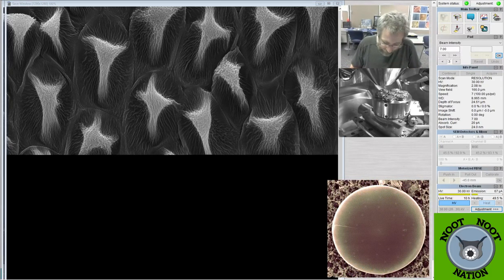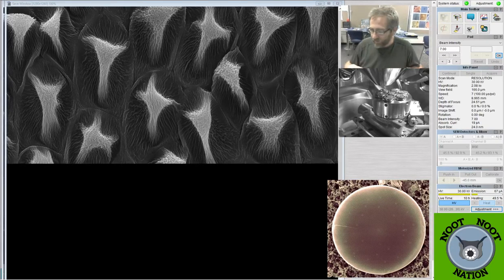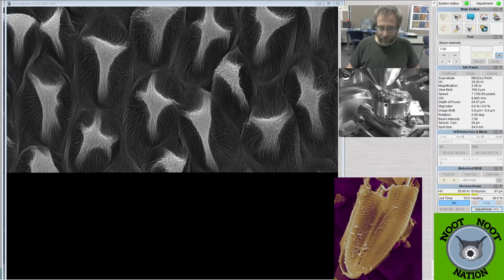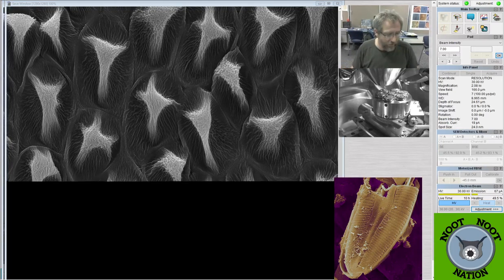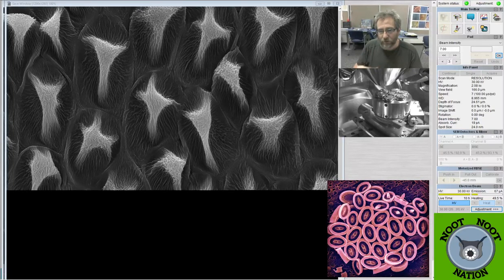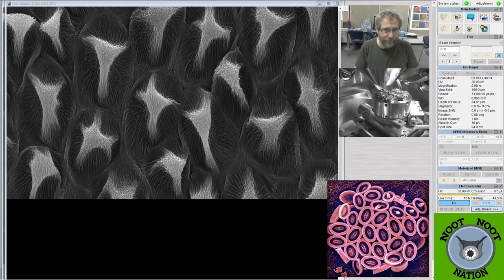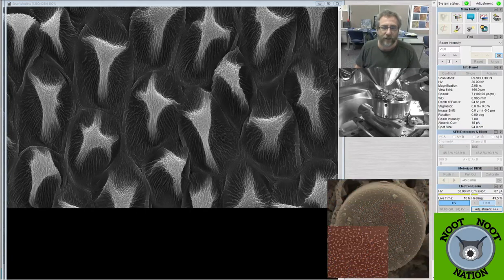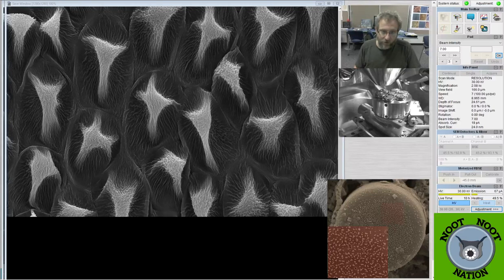So I collected that. I brought it back to my lab here. And then I disassembled the flower a little bit by pulling it apart with a pair of tweezers, and then put it onto an SEM stub, which was coated with carbon tape on one side. On the other side, it sticks to the actual SEM stub. And those stubs are below me in that picture you can see down there. That's what the beam is focused on right now. So I mounted it on there.